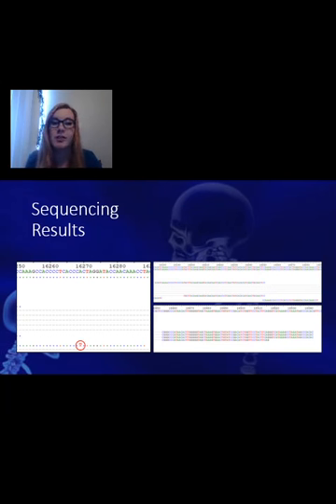However, in the left image, sample RE-2 exhibits a base change at position 16269. This base change is from adenine to thymine. However, because this is not a common polymorphism, it could be a damage in the template DNA that was amplified, and further sequencing would need to be done to analyze that further.